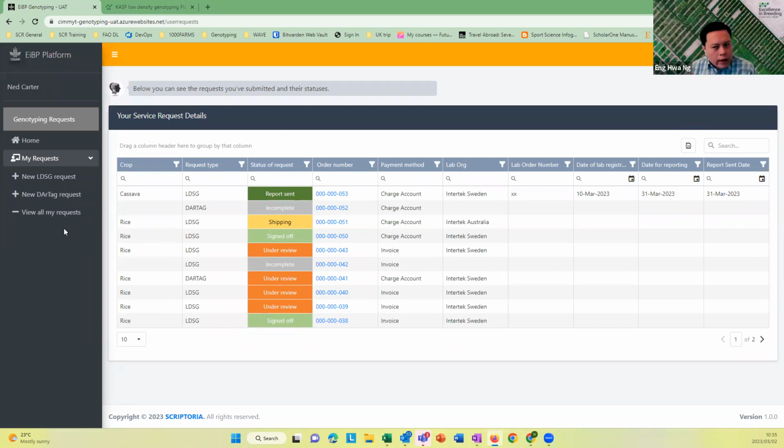So I can take that, Ismail. Yes, certainly, because that import requirement form is a static form, so periodically it does get updated. What we'll likely do in the future is add that in the shipping section.